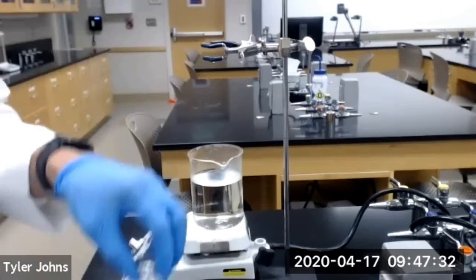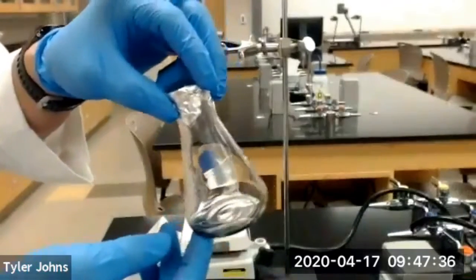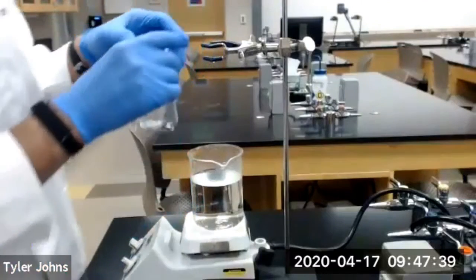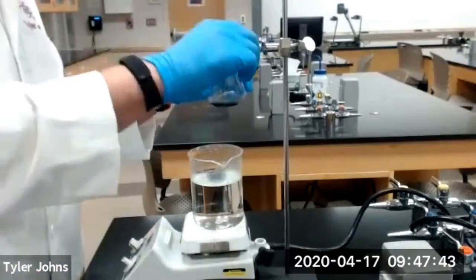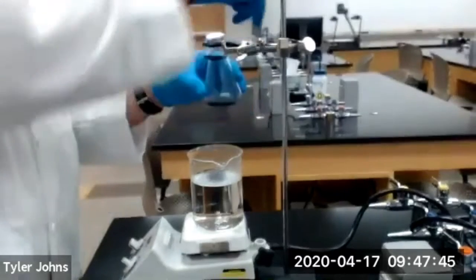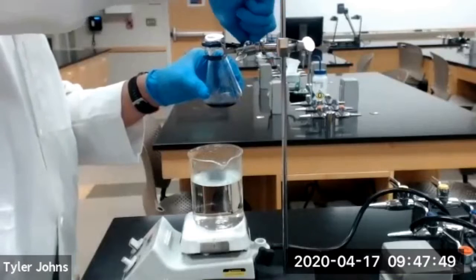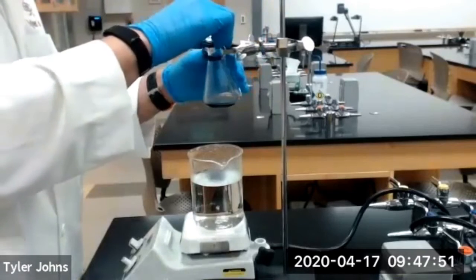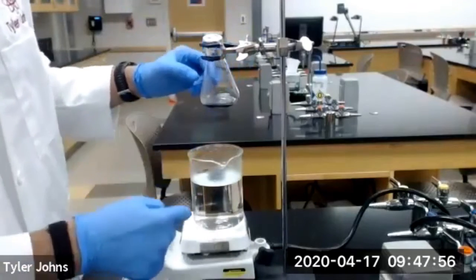We are going to take our 125 mL Erlenmeyer flask plus our volatile liquid and we're going to clamp it using a utility clamp, and we're going to lower it into our boiling water.